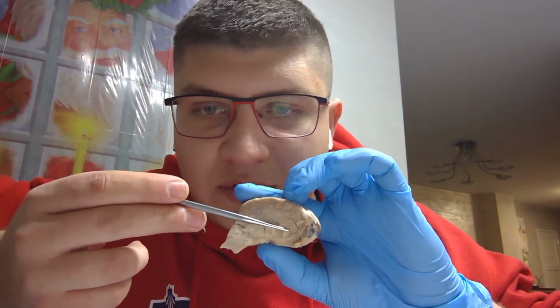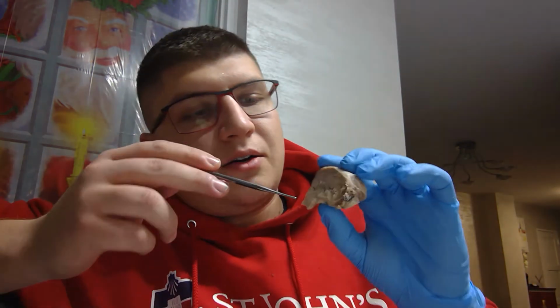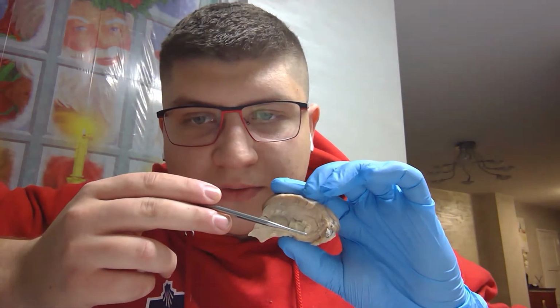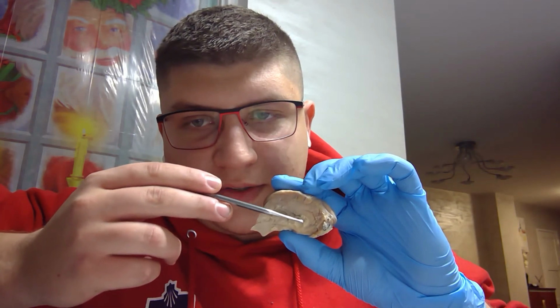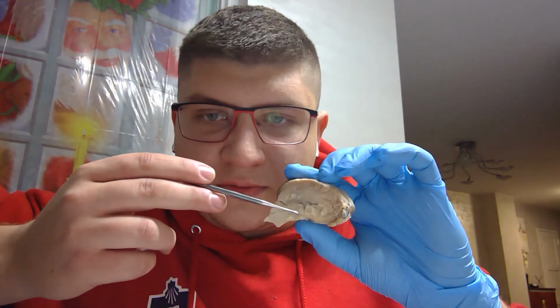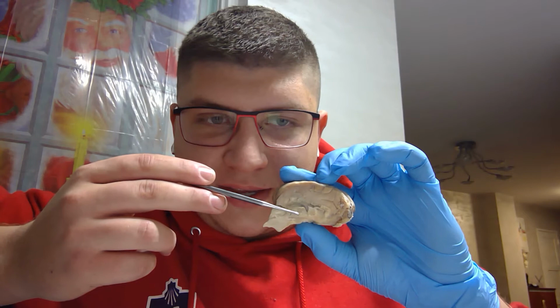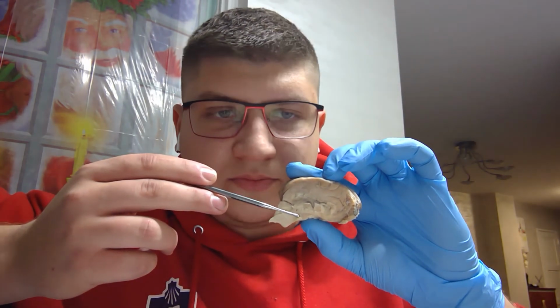The next thing, within the longitudinal fissure, you're going to find the corpus callosum. Corpus callosum should be located right about there. Close to where I was pointing out, you're going to also find the thalamus and the hypothalamus. The thalamus is a little bit more anterior, closer to the anterior of the brain. Going a little bit down, you're going to find the midbrain, which is about right there. Going a little bit down, you're going to find the medulla oblongata.